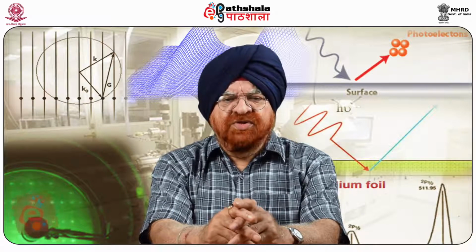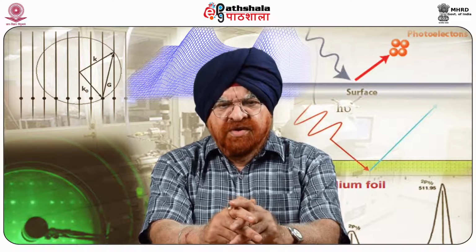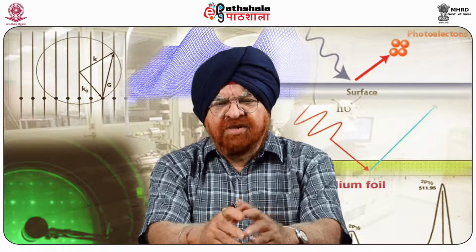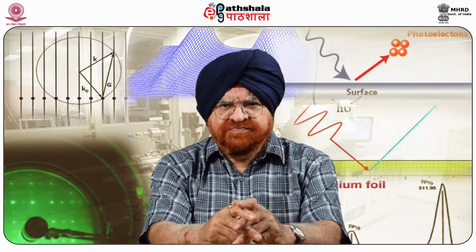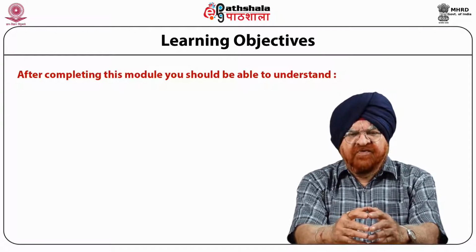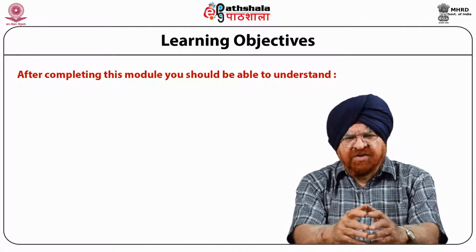Today, we are going to discuss the module Chemical Force Microscopy. Under this, we shall be talking mainly about data analysis, and this comes under the paper Surface Analytical Techniques Part 1. After going through this module, you will be able to understand various factors related to the data analysis.